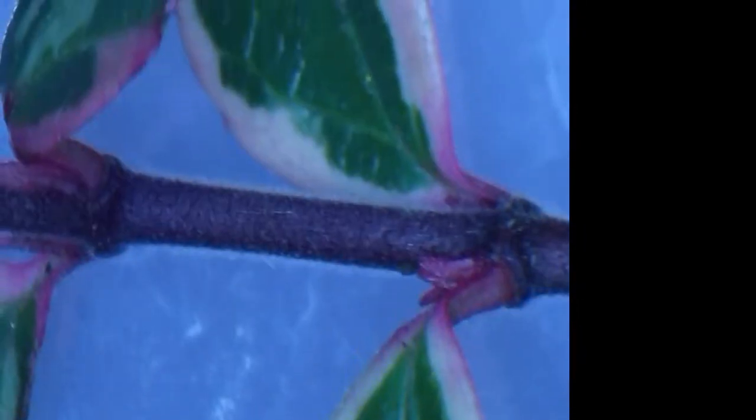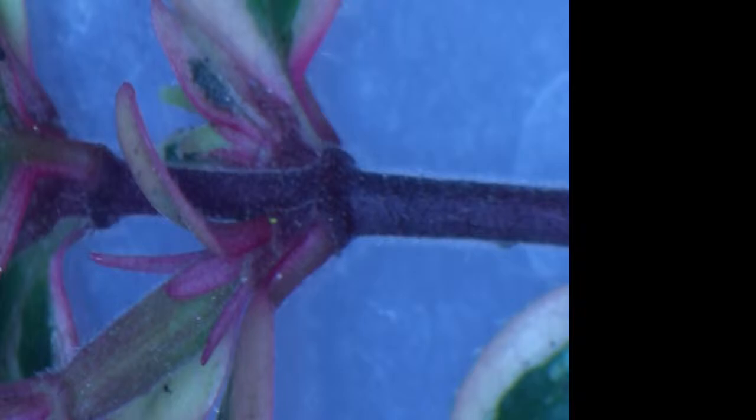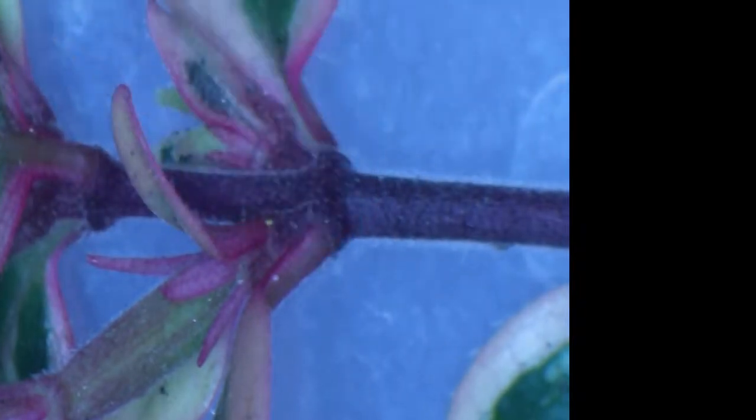As I go further down the stalk here, there's some really cool little leaves that have variegation on them. It's definitely not a natural plant. This is a cultivar where they've bred it for these variegation patterns on the leaves. Very interesting and small leaves. Slight amount of fuzz on here. Nothing like the other one. It was all woolly. Just slightly fuzzy. So that was a nice specimen.